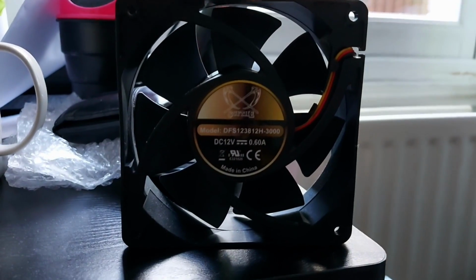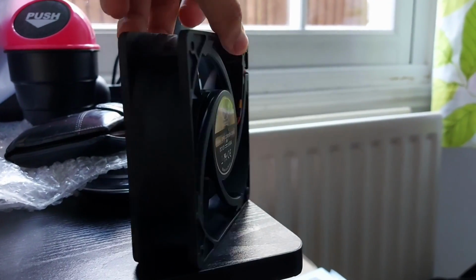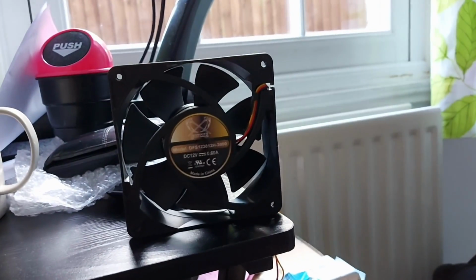For airflow, I use a PC fan. It's a Skythe Ultra PC fan and can run at 3000 RPM. It's wired into a normal UK plug and it runs on 12 volts. It's pretty powerful, so it gives you a good airflow. It only costs about 20 quid.